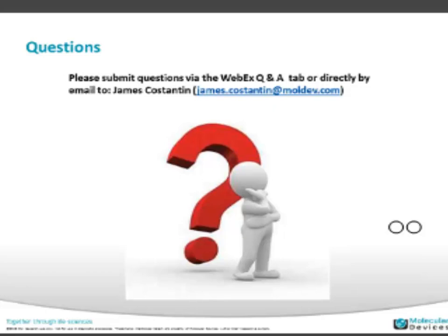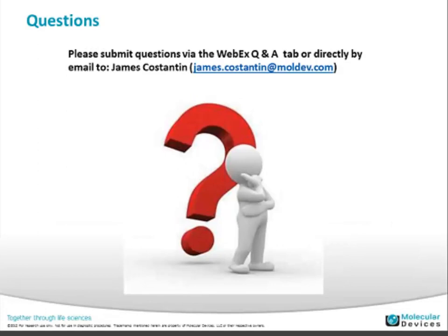Okay. The next two questions are for Mike. The first question is, a stable diazepam response over time is difficult to achieve on many different platforms, and that's what makes a PAM assay challenging. How does the iFlux meet this challenge?